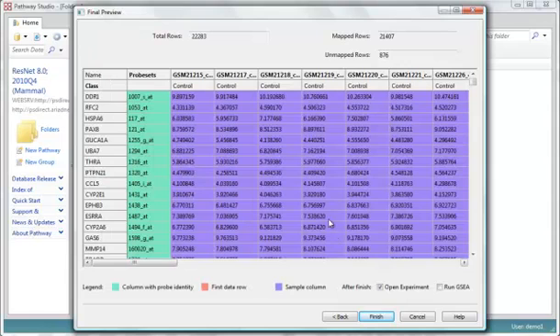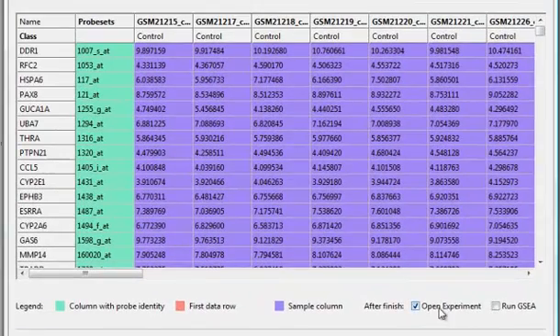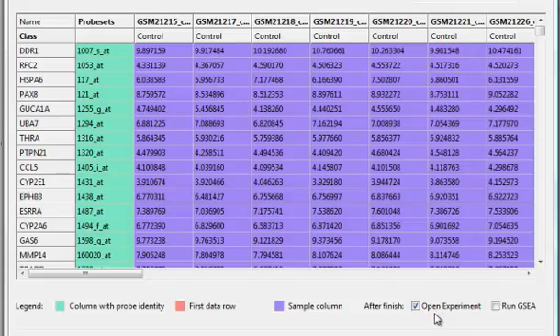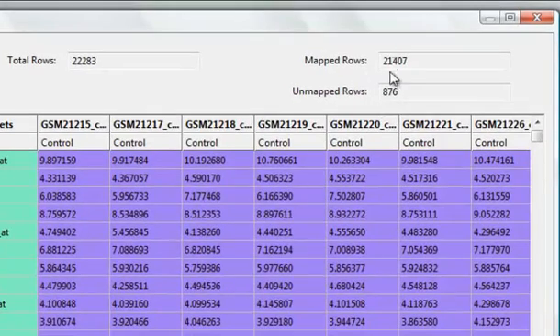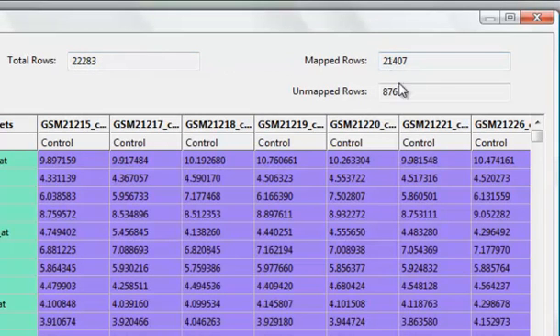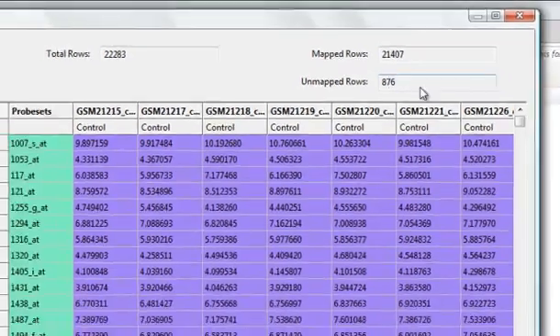It gives a preview pane of what the sample data will look like. This box is checked by default and it's going to open the experiment. Here's another important figure. The experiment had 22,000 rows in it and all but a few hundred of them were mapped. Those are probably the AFI control probes. But if you ever run this and you see a high number in there, then you would want to go back and redo the mapping to make sure that's correct.